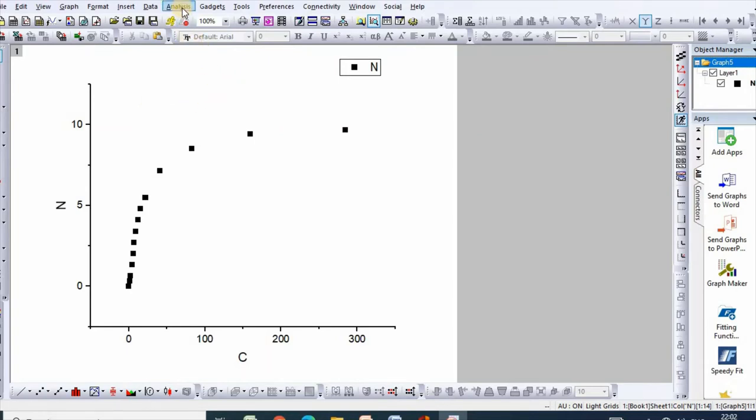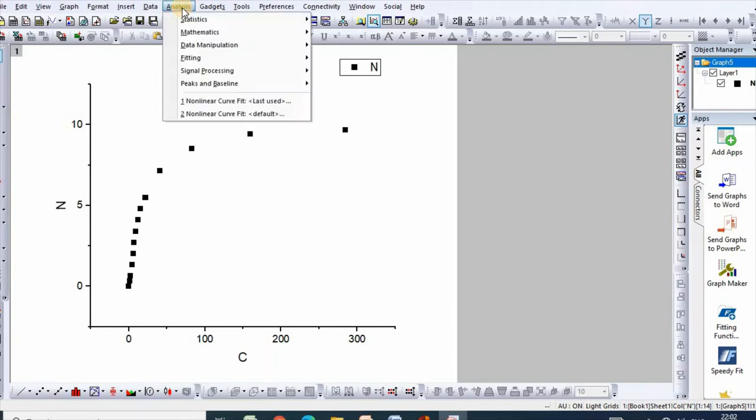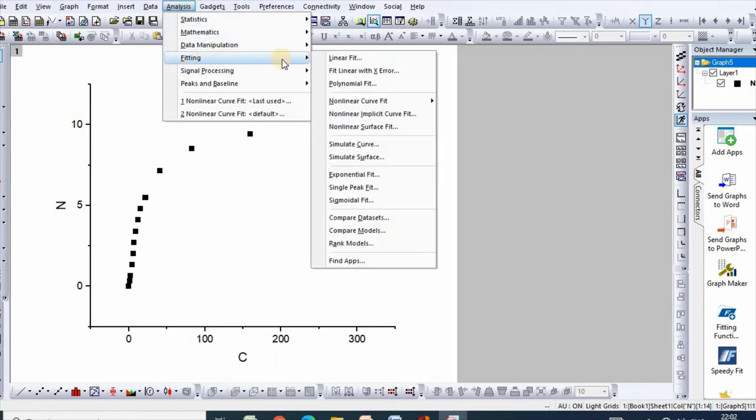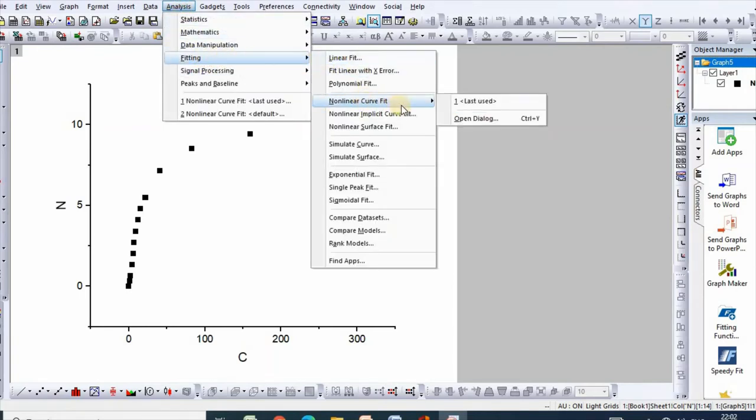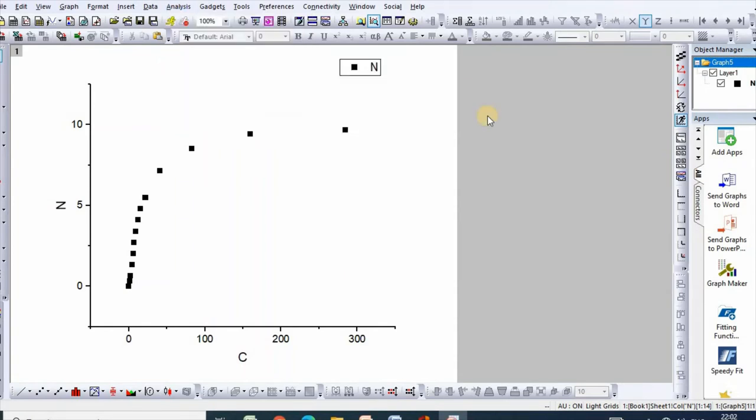You can go to Analysis, then Fitting, nonlinear curve, and then open dialog.